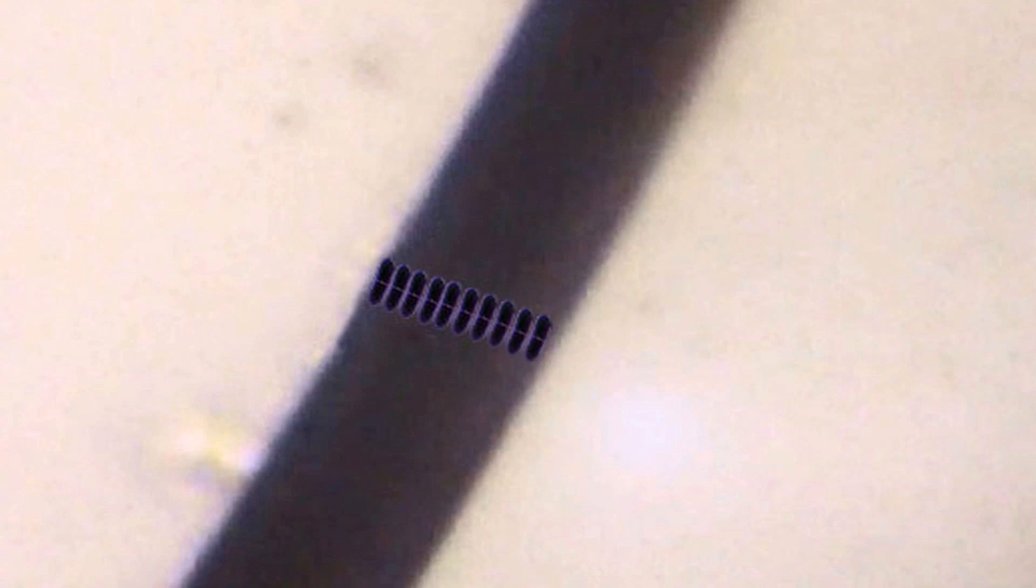Yes, each fiber measures 10 microns thick. And here is a fiber alongside a very fine human hair that's 50 microns across. 1, 2, 3, 4, 5 fit across the 50 micron hair.